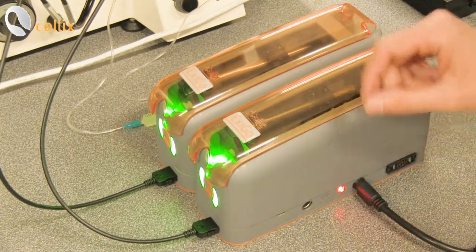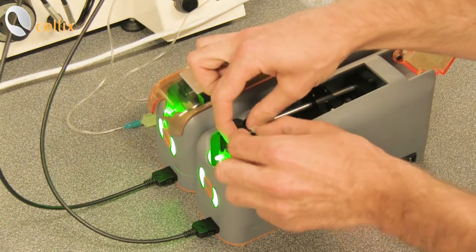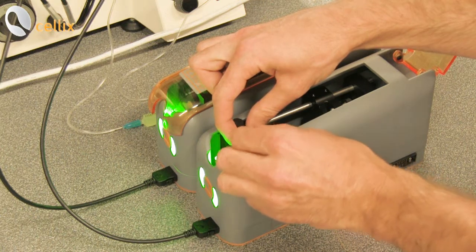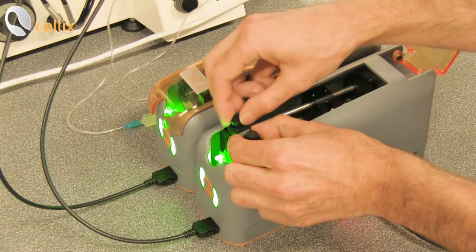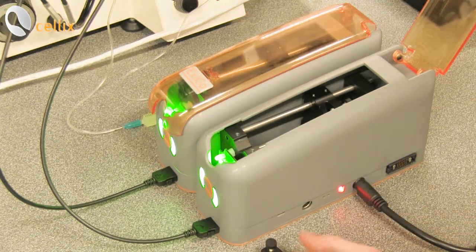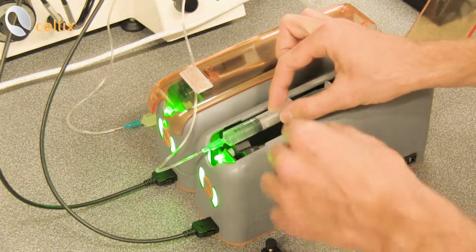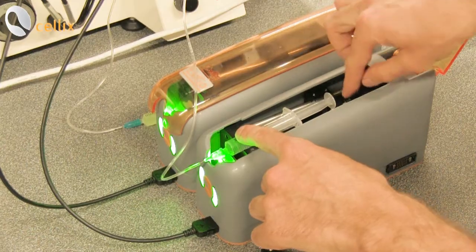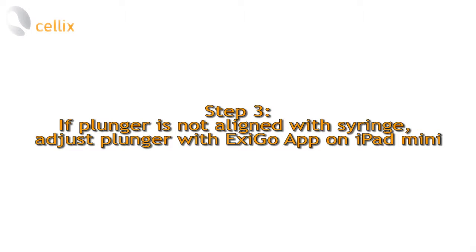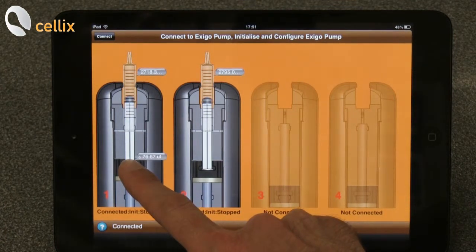We can now place the syringe into the pump. In order to do this we open the lid and then proceed to the removal of the clamp. We take the syringe containing the buffer solution and proceed with the adjustment of the plunger guide with the plunger syringe. You just need to move the plunger guide by a small amount. I will show you what volume will be dispensed.